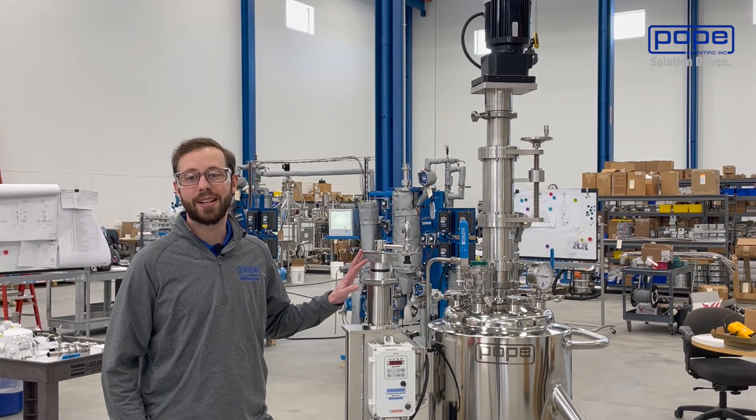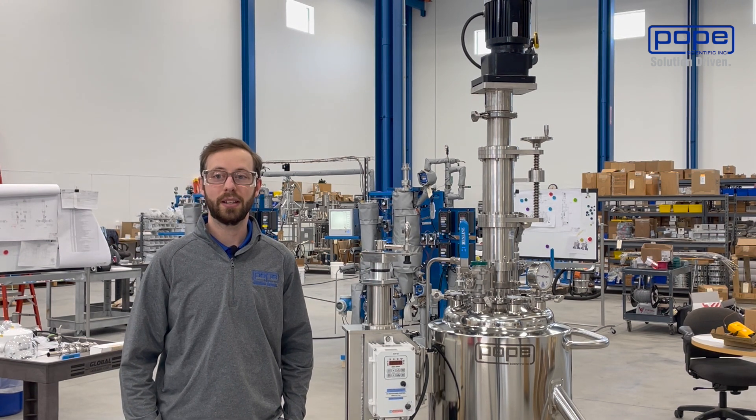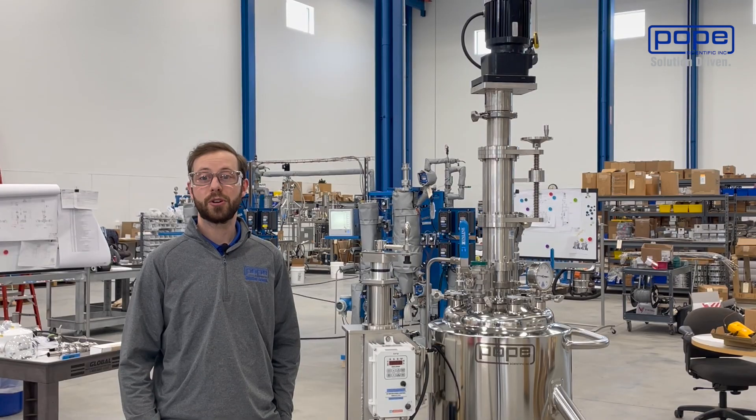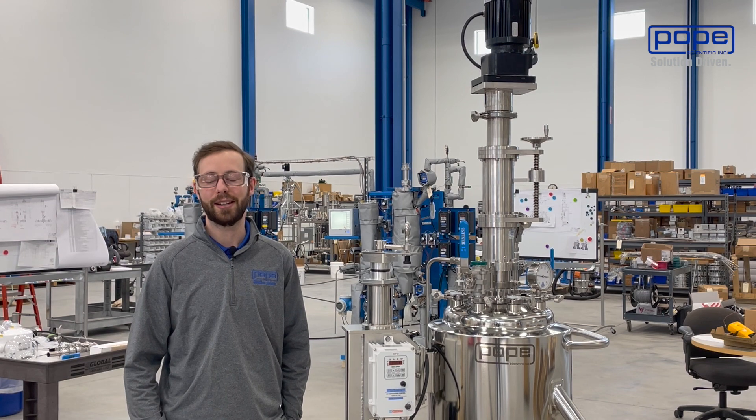The Nuche I'm standing next to today is our 50 liter Nuche. We manufacture in a variety of sizes from one liter up to hundreds of liters for these units. Our Nuche filter dryers can also be paired with Pope pressure vessels that can be used as your reactor for creating the isolate.